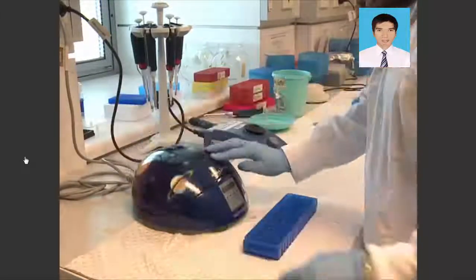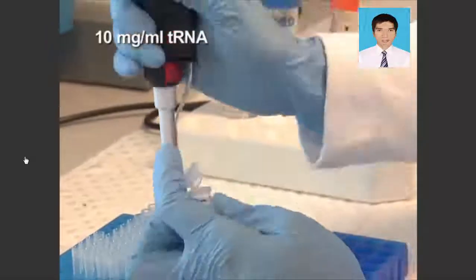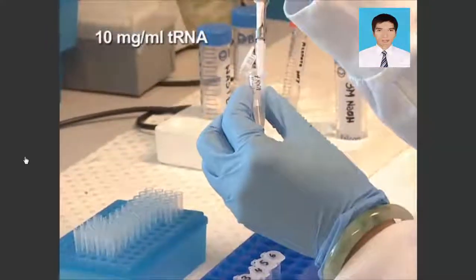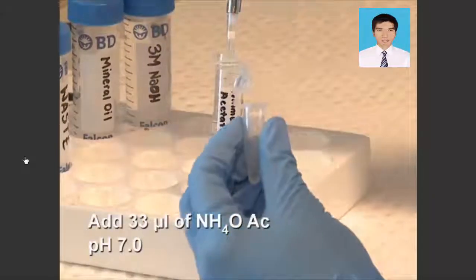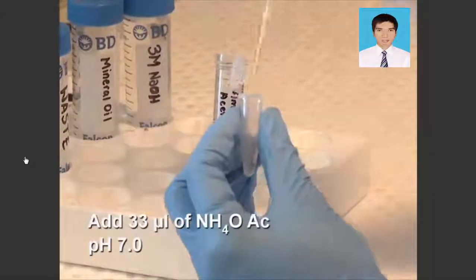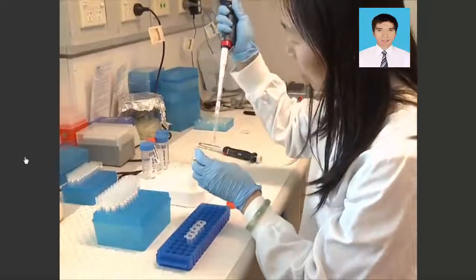Centrifuge the samples briefly and then add 1 µL of tRNA to each sample. Neutralize the solution by adding ammonium acetate to a final concentration of 3 molar.